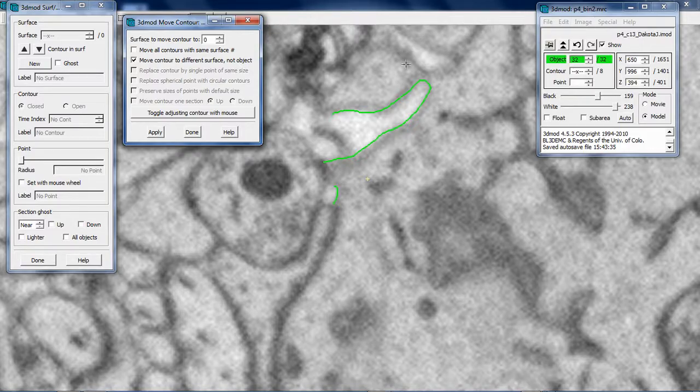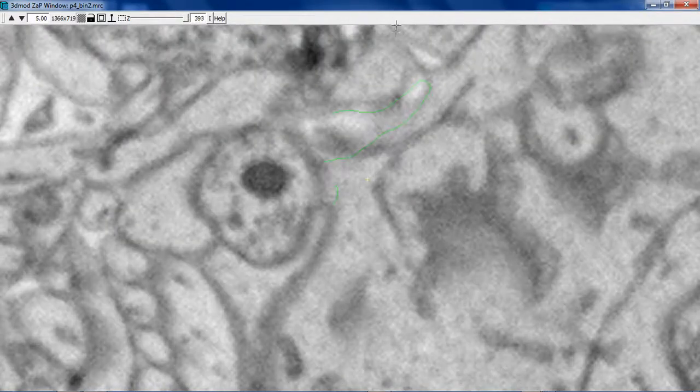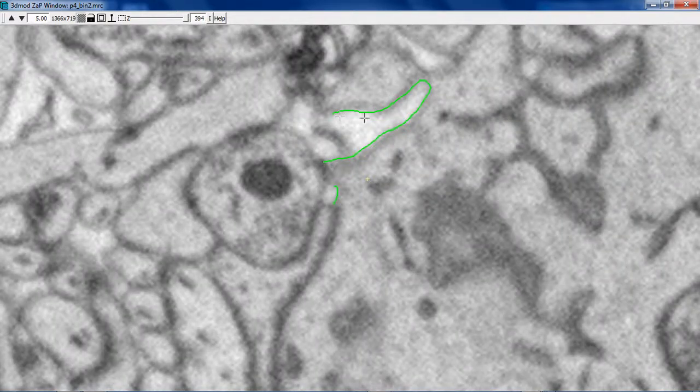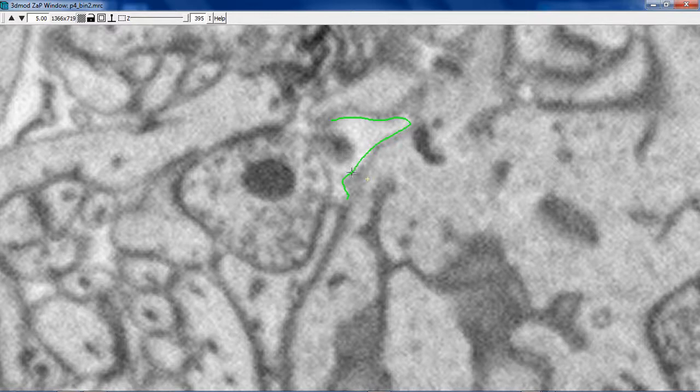Alright. Now, we also need one more window. As I said before, we need to have a copy of this. And the reason for that is that we need one contour here that will connect with this contour, and a second contour that will connect with this larger contour. And it's ideal that the copy of this be exactly overlaid with the original so that everything is continuous. We don't get any weird breaks or changes when we try to mesh this.